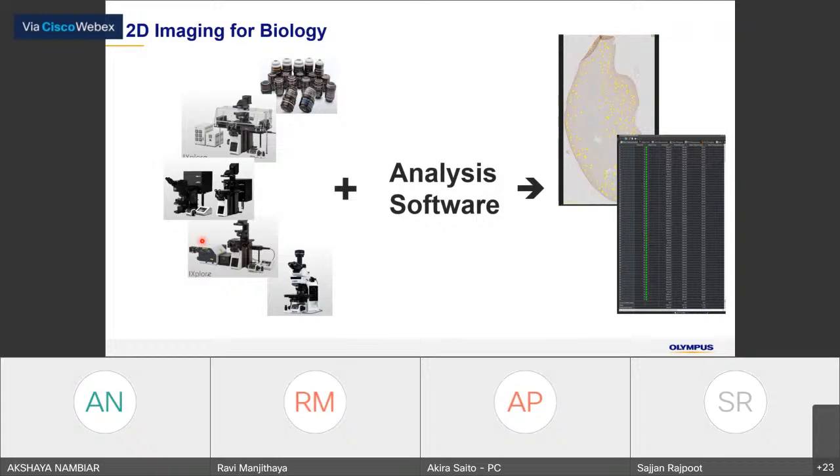Without that, the analysis will not work properly, and the result you get will not be as you expected. So it's very important to understand the optics, what kind of objective you are using, and what kind of microscope technology, I mean the observation methods, that you are using.